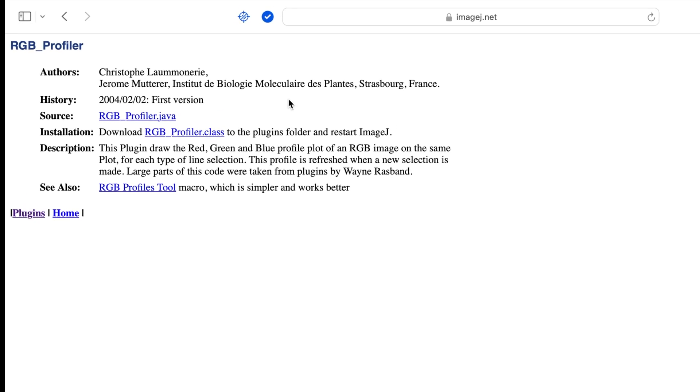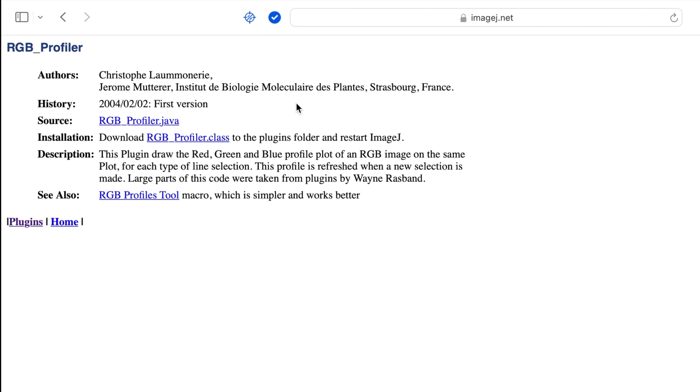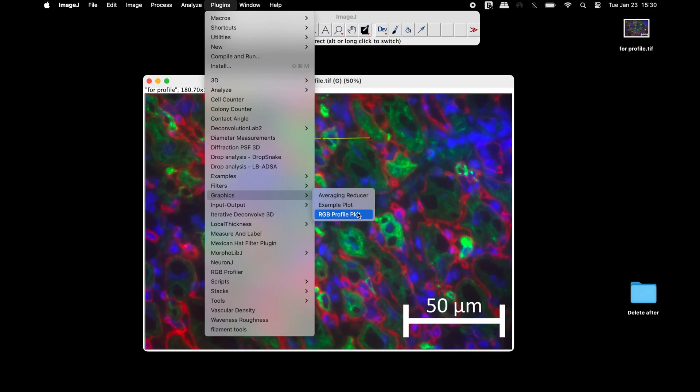Download and install the plugin. Once the plugin is installed, select the RGB Profile Plot plugin.